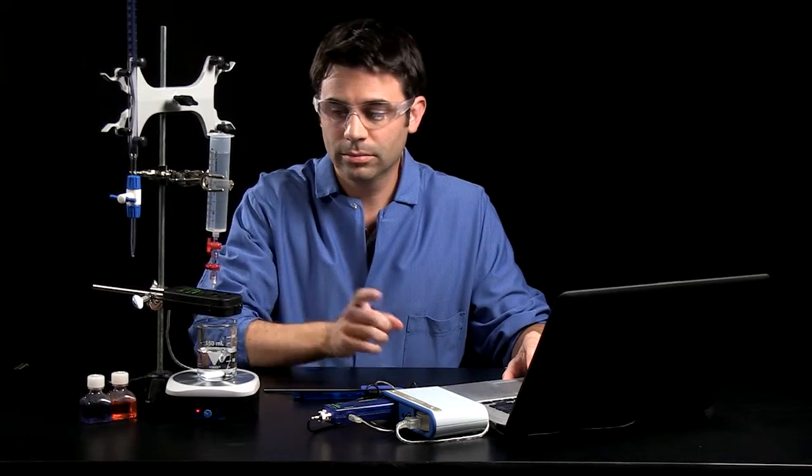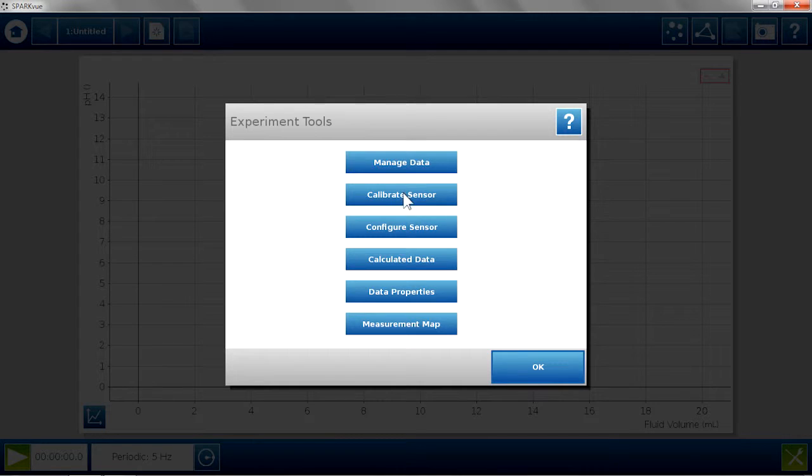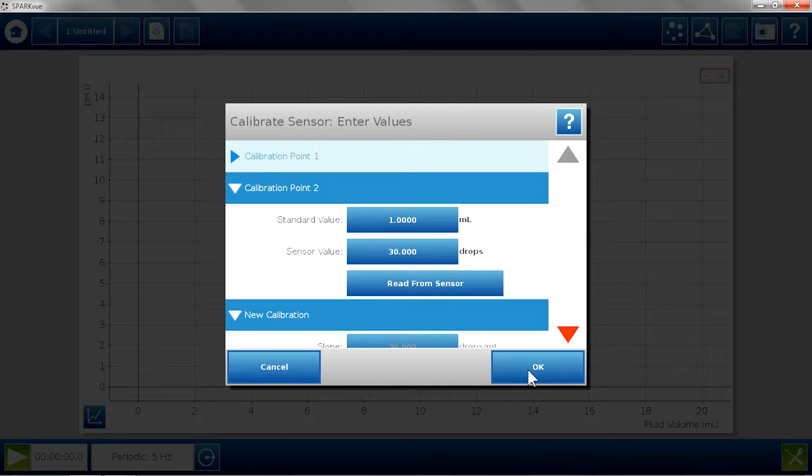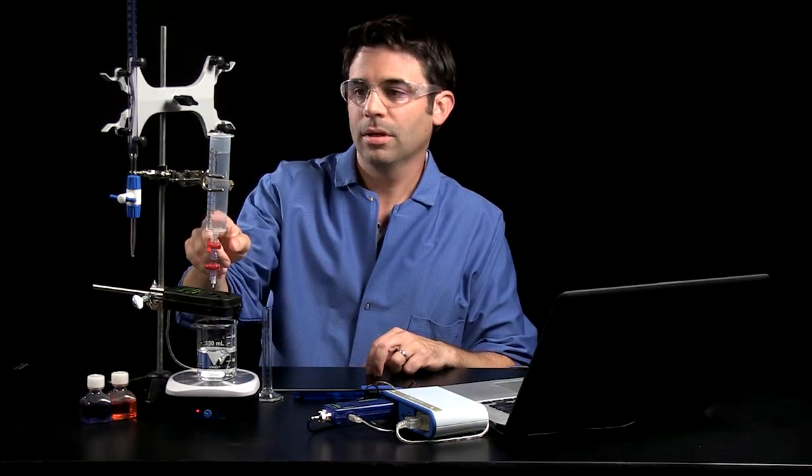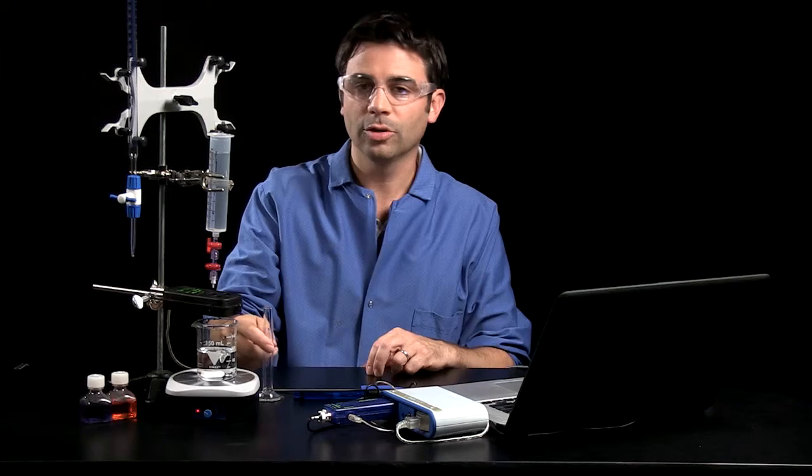And I need to calibrate my drop counter so that it knows what the fluid volume is. So I'm going to calibrate my drop counter, fluid volume. And the way to do this is you use a graduated cylinder and drop the titrant through the drop counter into the graduated cylinder until a certain volume that you want.